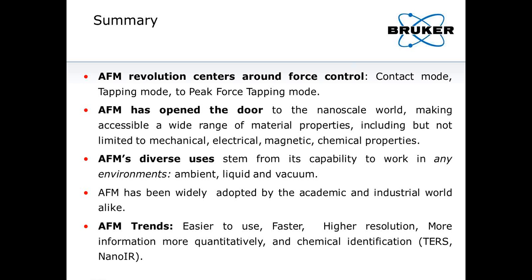I would say yes. For dopants, yes, and also with Kelvin probe force microscopy, if you have static charge on the surface, you will know whether it's a positive or negative charge.